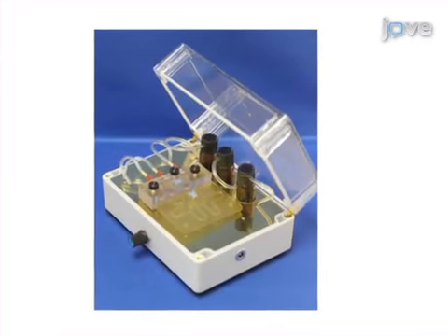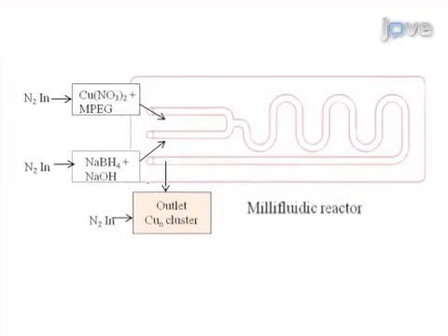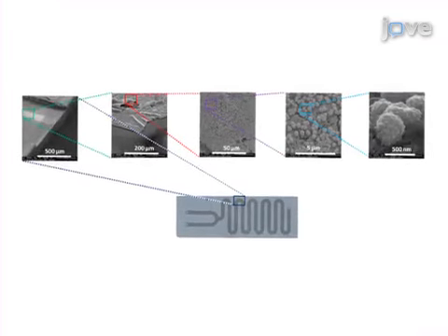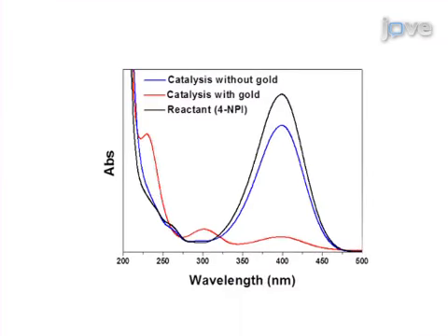Ultimately, these three experiments demonstrate that simple millifluidic systems offer opportunities for high-throughput synthesis, in situ investigation of formation, and carrying out continuous flow catalysis.